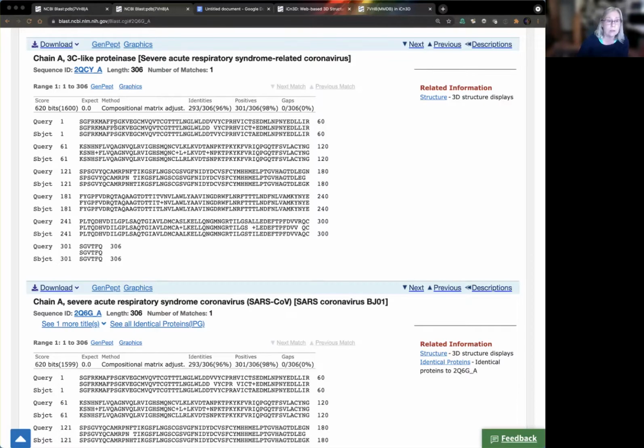So if the sequences are identical, if the amino acids are identical, you see them appearing in the middle. If they're not identical and they're not similar to each other, there's an empty space like I have right here. If the 2 amino acids are similar to each other, we would say that they're conserved. They have the same chemical properties, same shape, similar structure. There's a plus that shows they're conserved. That information is all reflected in this top information up here.